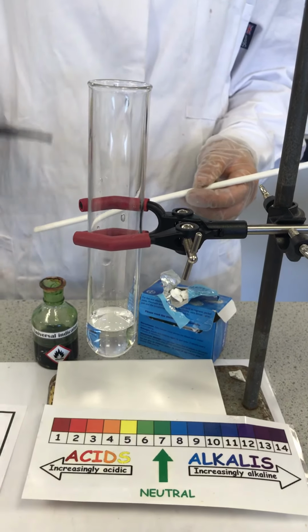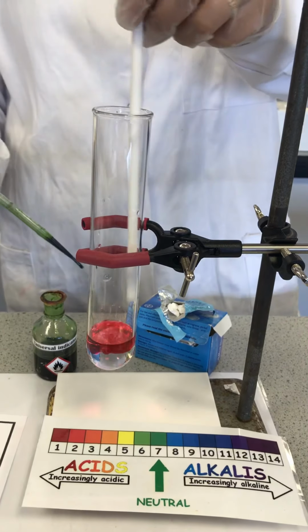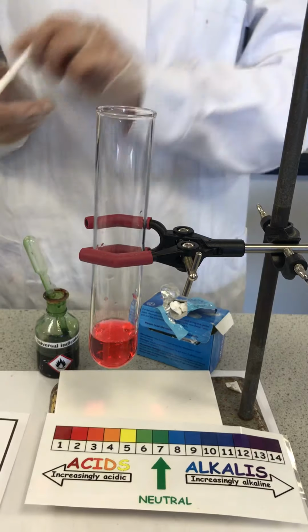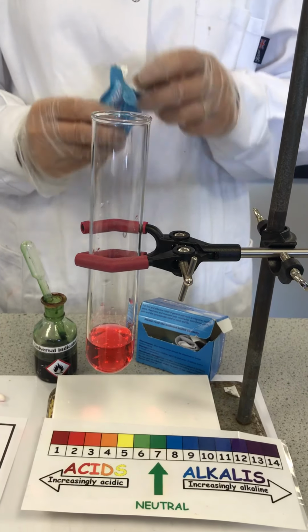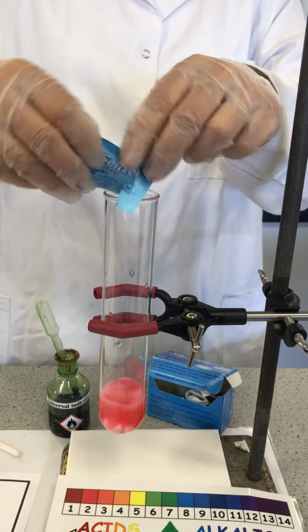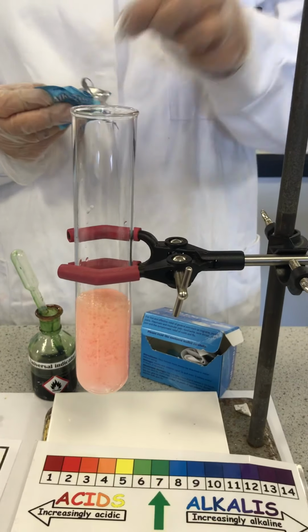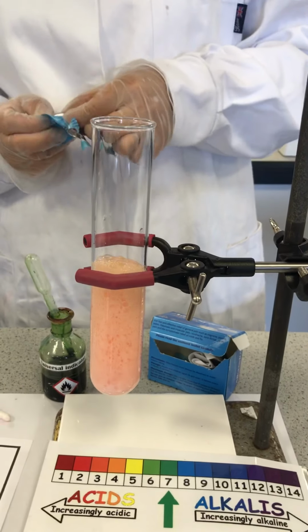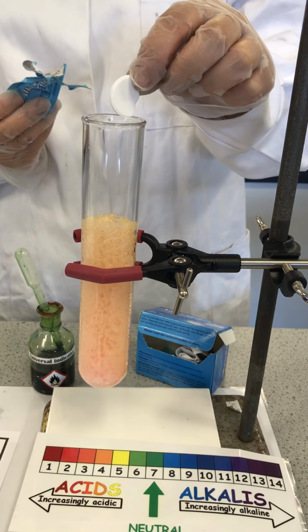Now we will add universal indicator into the boiling tube which contains hydrochloric acid. As you can see, the color went red, which indicates a strong acid. Now we will add the antacid tablet and see what happens. The antacid should neutralize the hydrochloric acid, and we will see this as a color change.